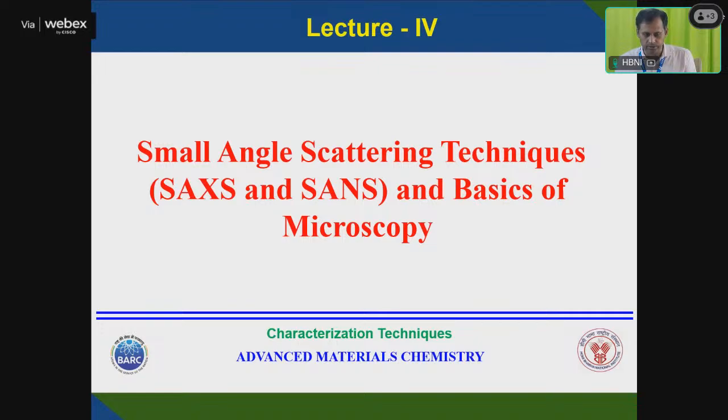So today we will discuss small angle X-ray scattering, specifically scattering techniques. Diffraction is a subset of scattering. In diffraction, we use a wavelength lambda of about 1.54 angstrom in the case of copper and 0.7 in the case of molybdenum. Those are equivalent to the lattice spacing, so that's why we get information about the crystal structure.